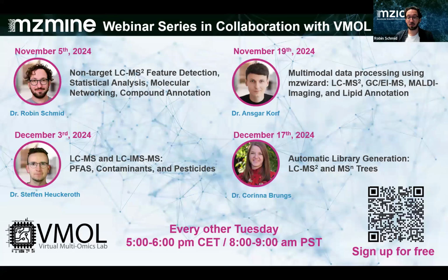Then Steffen is going to take over, and Steffen is the main developer who introduced ion mobility mass spectrometry in mzmine. He's going to mainly focus on ion mobility spectrometry processing, but then also, for everyone who is not yet processing this kind of data, he is going to cover some other compound classes and maybe workflows that you might be interested in. So it's definitely interesting to tune in to see some more on another separation dimension.